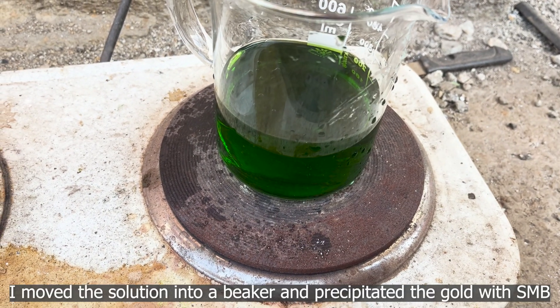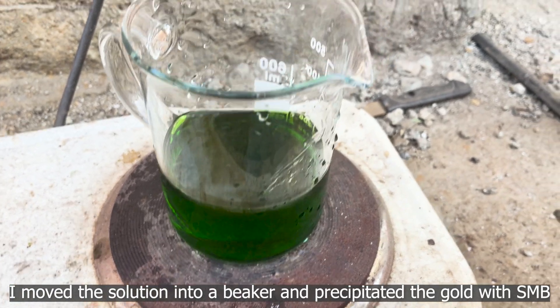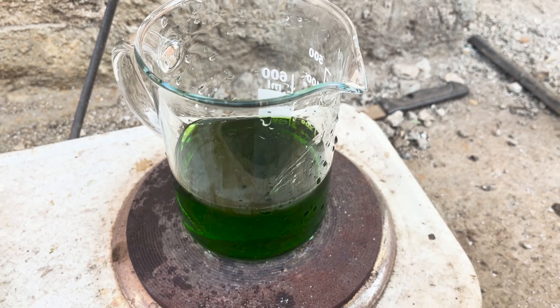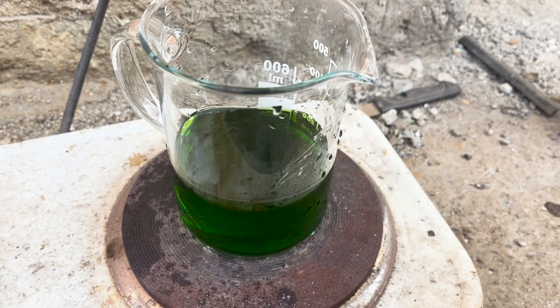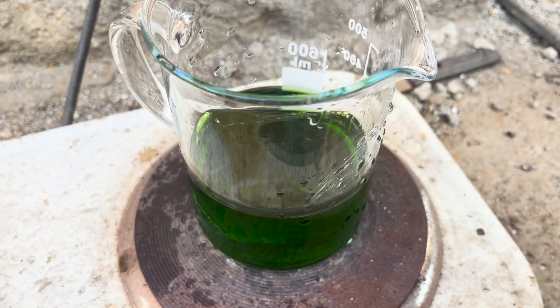I moved the solution into a beaker and precipitated the gold with sodium metabisulfite.